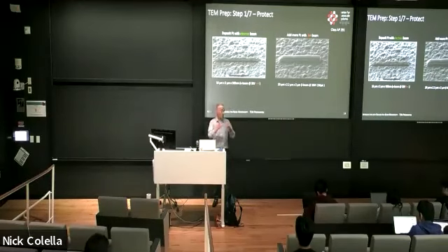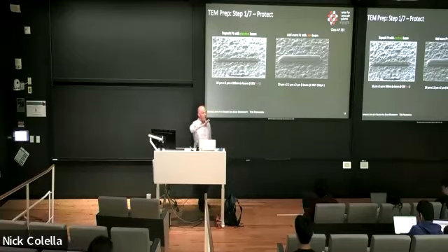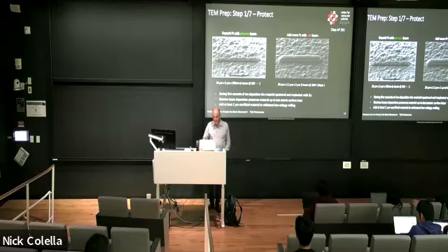So you can actually cover 2D material and prepare cross sections, and you can see in the cross section the actual 2D material like graphene. So we are basically generating a buffer layer using the electron beam, and then we add more material on top. With this we are protecting the region of interest.